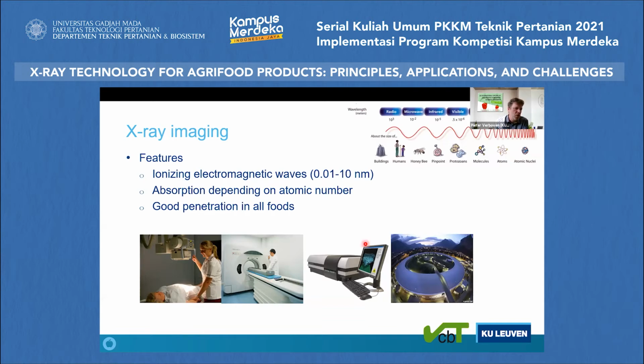But of course, today we also have desktop type of instruments that we can put in the lab for doing our research. And we also have very large scale instruments like synchrotrons, where if you see an example here of the one that is located in Grenoble, where we can do very high intensity X-ray imaging to see very small details and very high contrast in elements. Of course, they are not very easy to access, and you can only do experiments there if you have something that is very novel and exciting to try out.